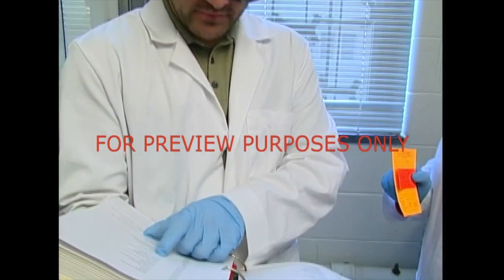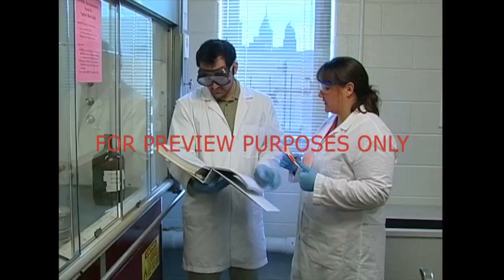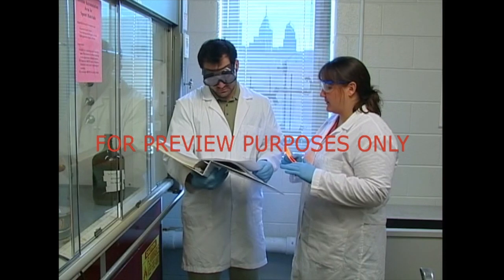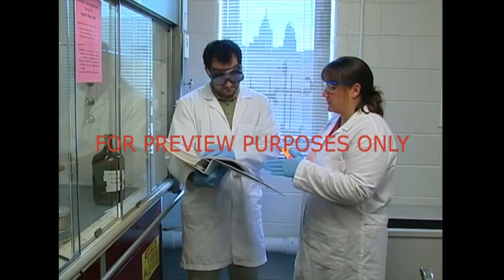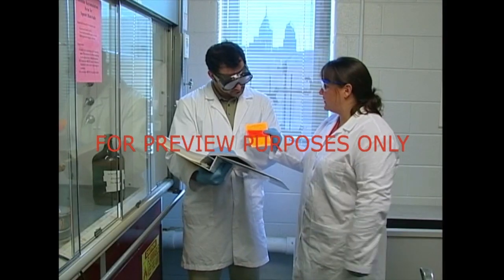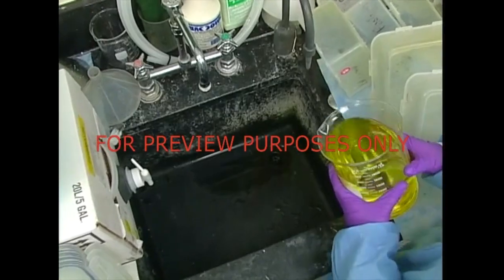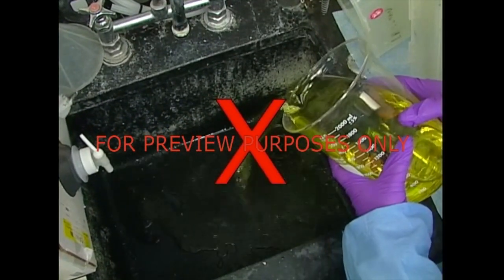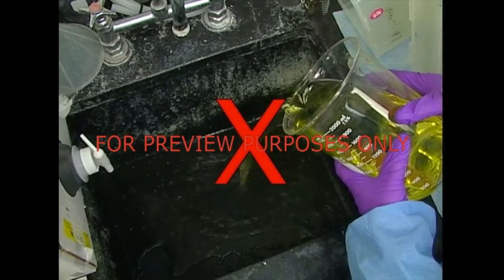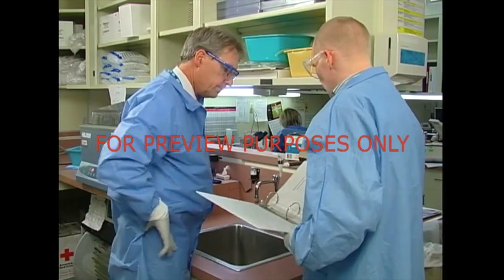What to do with chemical and infectious waste is another thing you need to know about. Your facility has a written policy on how to handle this type of material. Plan for how you'll dispose of any waste before you begin your work. A mistaken disposal could cause serious problems with public health and the environment, and could subject your lab to harsh criminal and civil penalties. Ask your supervisor or safety manager if you have any questions.